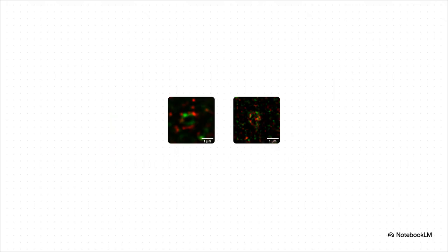And this isn't just for looking at test patterns. Here we're seeing real proteins inside a cell that's been infected with a rotavirus. The conventional image on the left just shows these fuzzy clouds of red and green, but after MSSR, on the right, you can see these intricate, almost ring-like structures. You can see how the viral proteins are actually organizing themselves. This is the kind of detail that helps scientists figure out exactly how a virus builds its little replication factories.